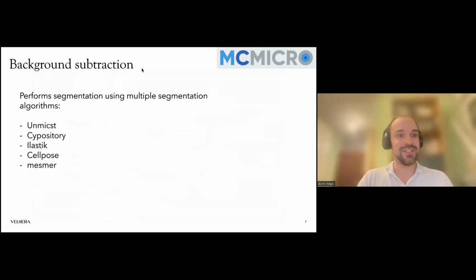Now we are talking about segmentation. And MCMICRO can use 5 different segmentation algorithms. Later down the line, any additional downstream analysis is performed separately on each of the different segmentation outputs. I'm not going to go deep into these segmentation algorithms, but on these slides you have a list of different algorithms that can be used with MCMICRO. Each of these is optional, and in the workflow itself, you can choose which of these algorithms you want to run. It might not make sense to use all of these.